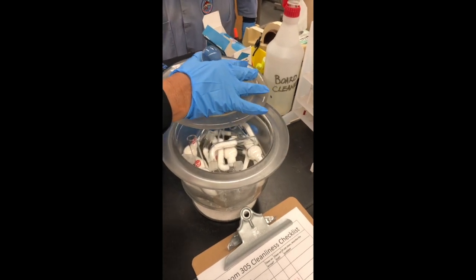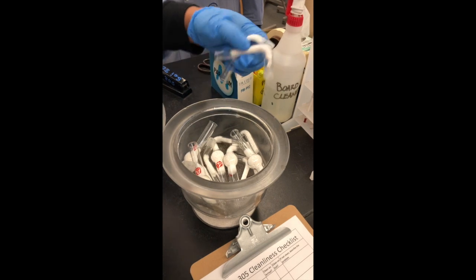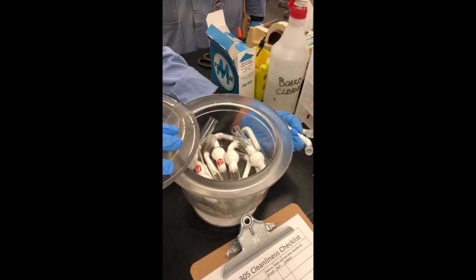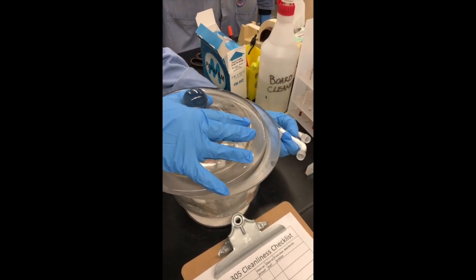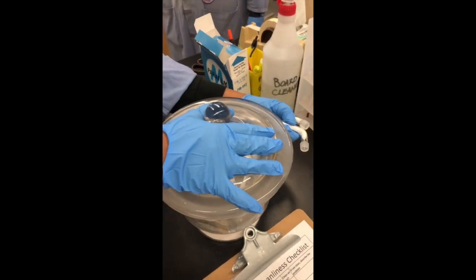Here we have the proper way to operate a desiccator, pulling out the drying tubes for the reaction filled with calcium chloride. You always remove a lid from a desiccator sideways, never straight up and down.